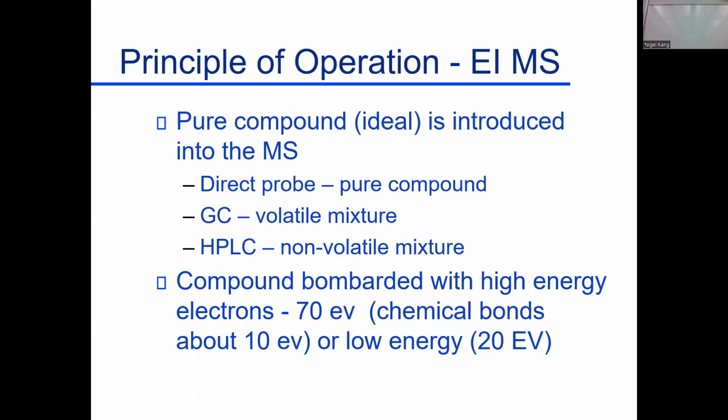So we're generally looking for high energy. Many bonds in a molecule are less than 10 electron volts. We hit it with 70. We put in enough energy, like I say, to simply blow it apart. That's most common. We use very high energy to get many pieces.